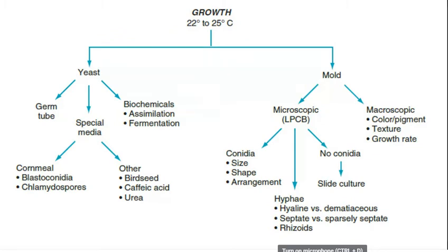Kasi kung maalala nyo, meron tayong present earlier dun sa introduction about a fungi exhibiting two forms in one culture, which means na dun sa isa lang yung environment niya, na condition niya, pero na-demonstrate niya yung dalawang phases, yung mold at saka yeast phase. Okay?